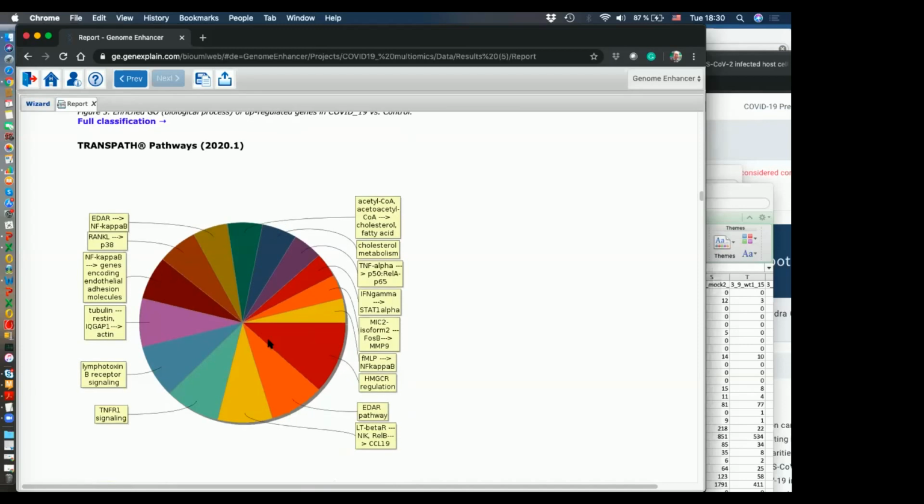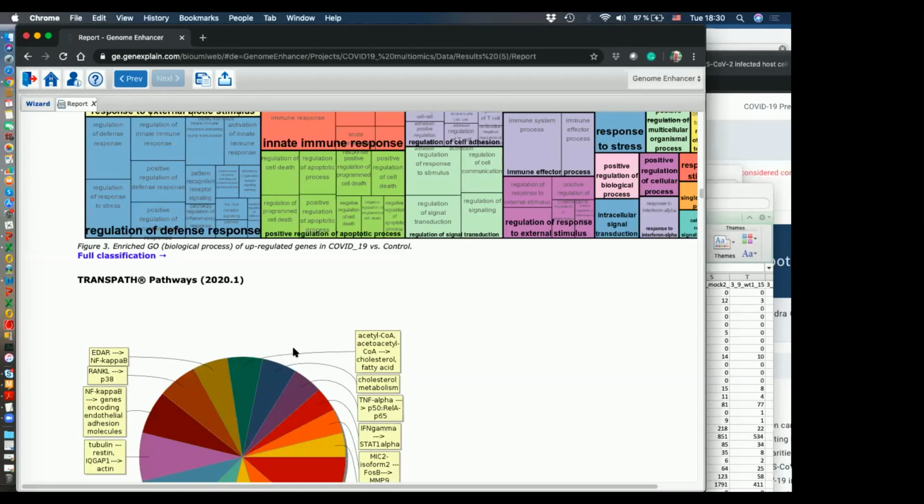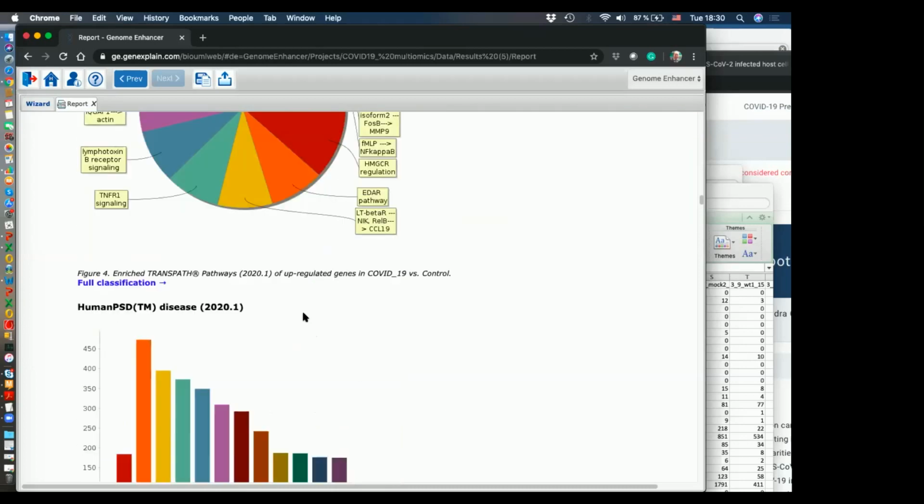And here we take those genes and map them to various standard pathways. And then you see those pathways related to immune response, like TNF alpha pathways and interferon gamma pathways. They are activated, and the NF-kappa B pathway, they are activated. So we clearly see the immune response genes are activated. And in fact, even here we can say that it is not so much the infection itself, but rather a lot of immune cell response, which we see here.